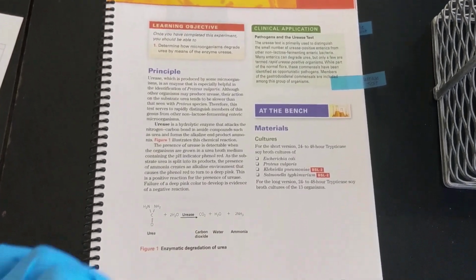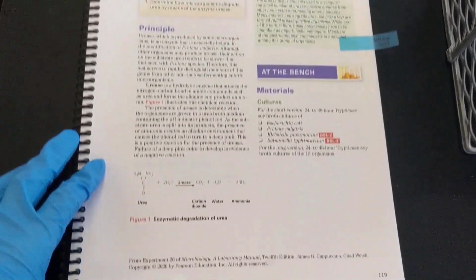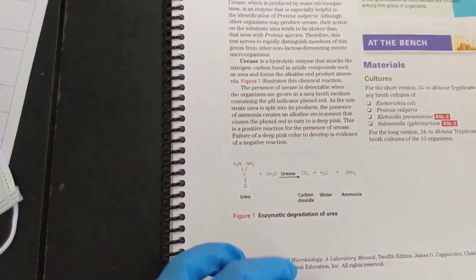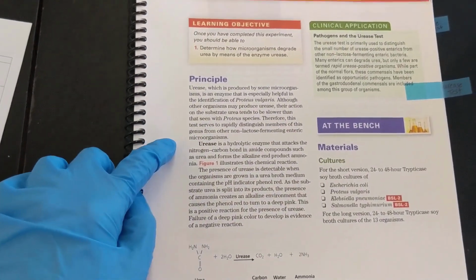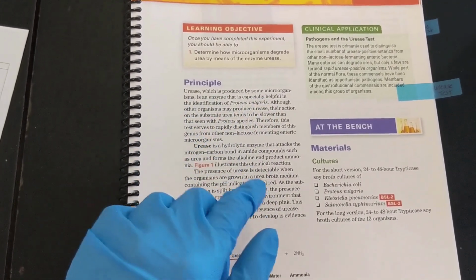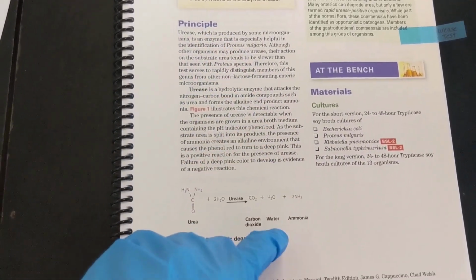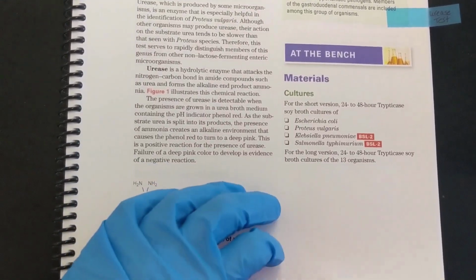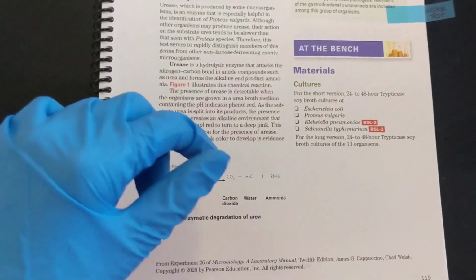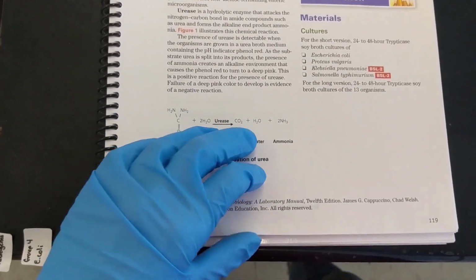So our last test in biochemical test 1, at least, is the urease test, and we need to read that. That's page 119. So this explains the principle that urease, which is an enzyme, is produced by some microorganisms, which is helpful also in identifying P. vulgaris. So this gives you a good idea of how we can identify it. So basically our broth contains a pH indicator, which we'll see in just a second.